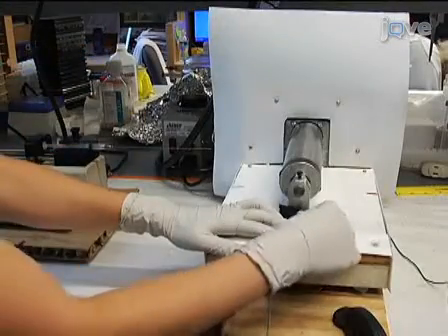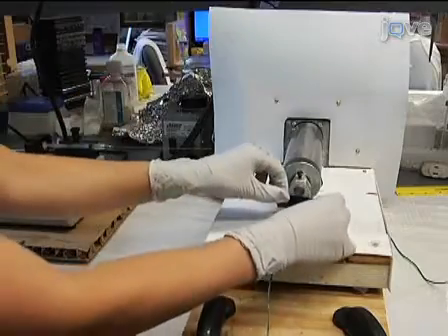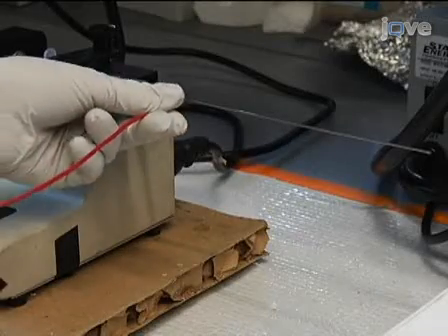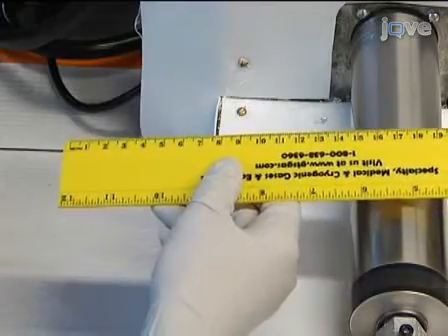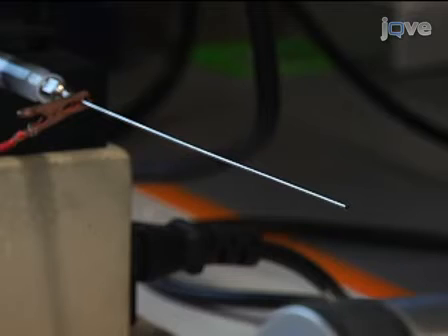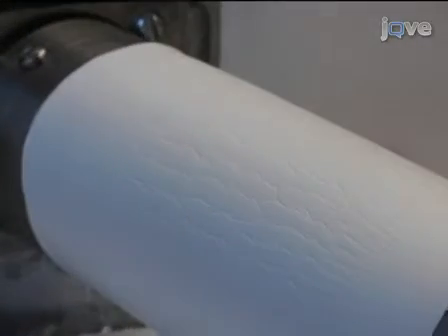Attach the grounded lead of a high-voltage power source to the collection apparatus. In this procedure, we will use a mandrel rotating at about 10 meters per second to collect aligned fibers. Attach the positively charged lead to the needle, and adjust the needle or collecting device such that there is a 15 cm distance between the two. Start the syringe pump flow, and when fluid is visualized on the tip of the needle, turn on the power source and set the voltage to 22 kV. Collect fibers onto the scaffold until the desired thickness is reached.